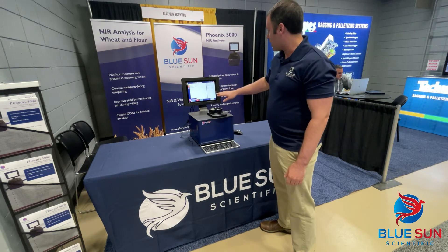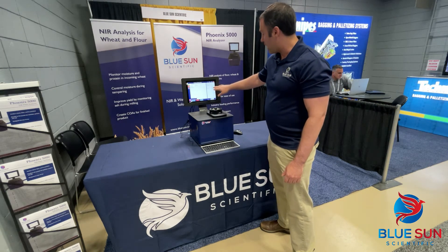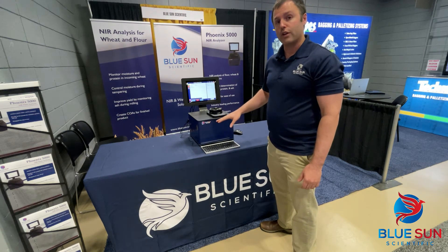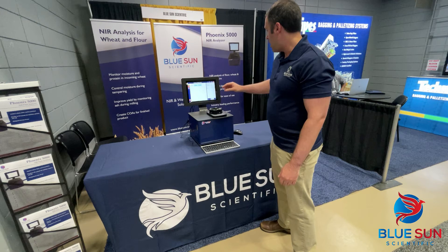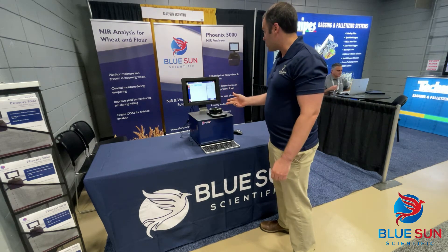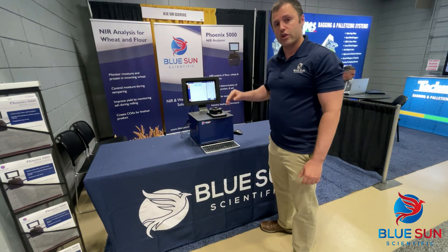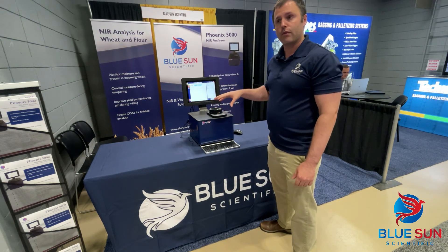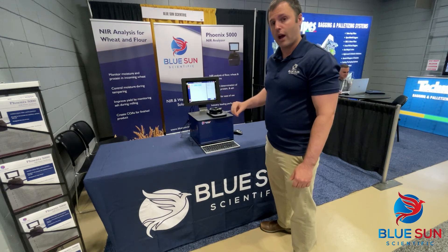You can see the results displayed on screen. The instrument is fully sealed, so it's great for a laboratory or on a production floor. Our results are here — we can see protein, ash, and moisture values, as well as the global H, which lets us know that our sample falls within the expected results of the calibration that we're using.